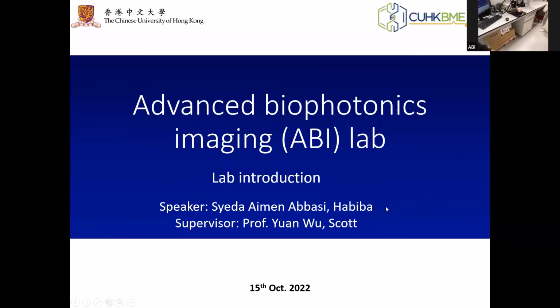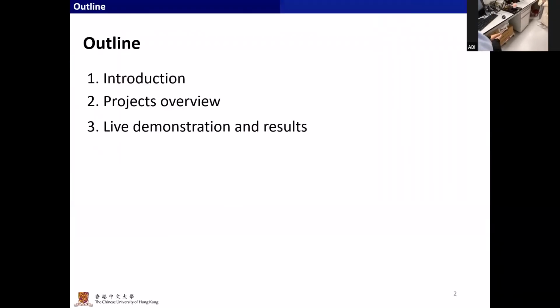Okay. Hello, everyone. We are the Advanced Biophotonics Imaging Lab, and I'm Eamon. It's my pleasure to introduce you our lab. So, firstly, the outline for today's lab tour is first I'll give an introduction of our research areas and the main technologies that we use, and then some introduction to the projects that we're ongoing. Lastly, we'll have a demo and showing the results of our experiments.